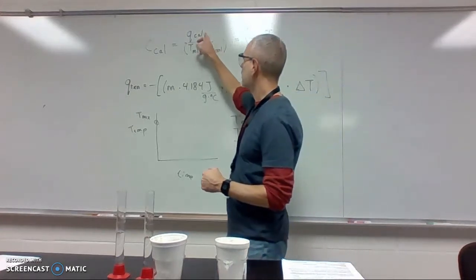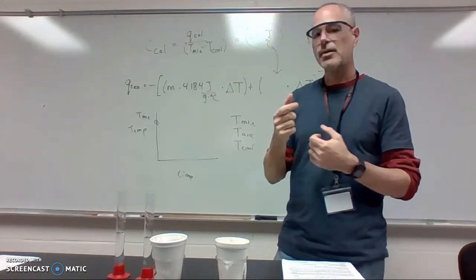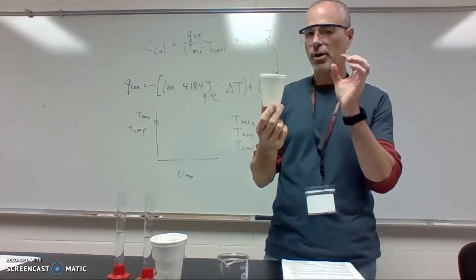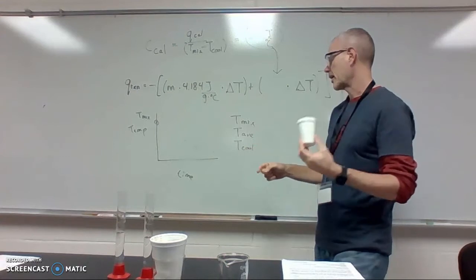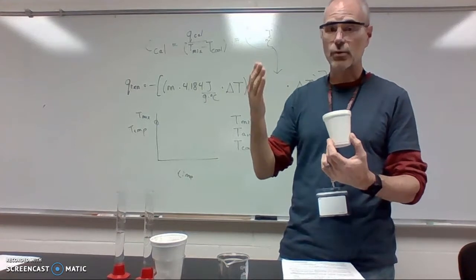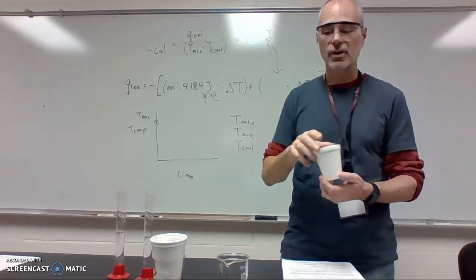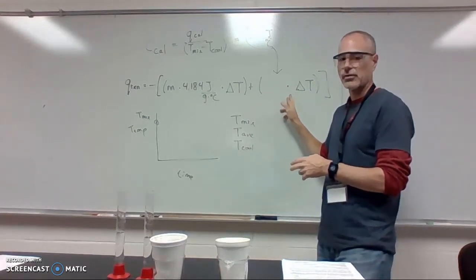If we take that value that we are accounting for and divide it by the temperature range that the calorimeter moved, or the temperature change it was exposed to, and this is the part we have to be careful with. We divide it by 2 different numbers, the T cool, because that's the temperature it's starting at, and the T mix, the temperature it actually went up to, that'll give us the energy absorbed by the calorimeter over a specific temperature, 1 degree Celsius. And we're going to use that value in this equation here for the other 3 reactions.